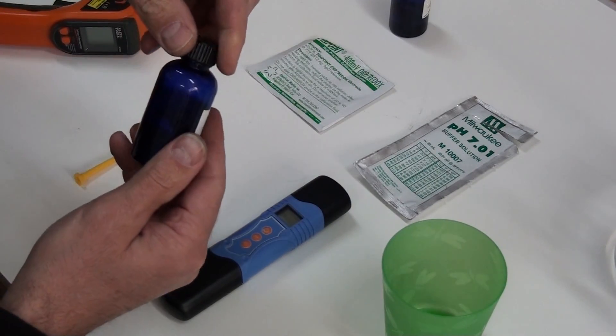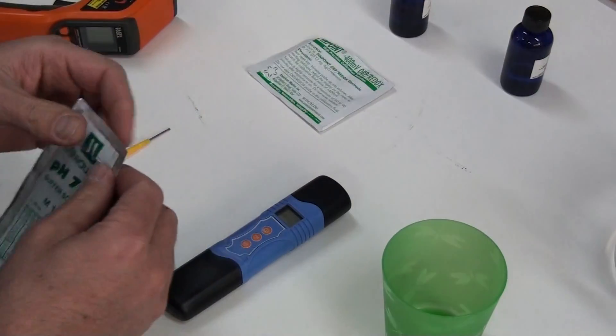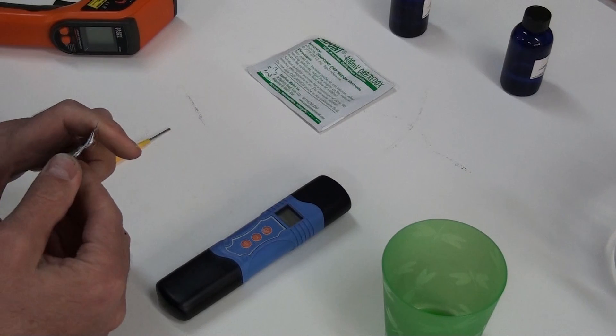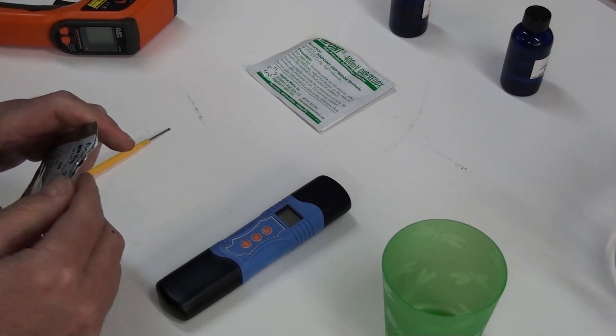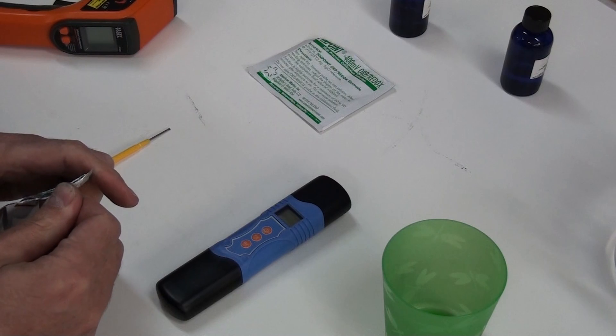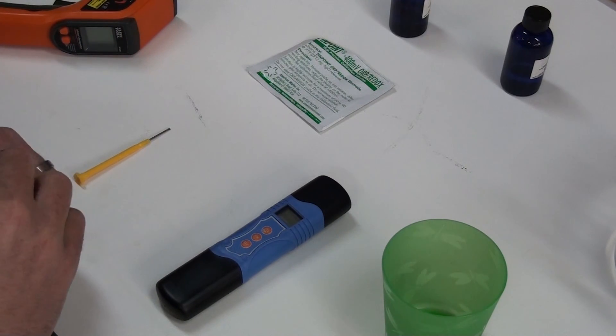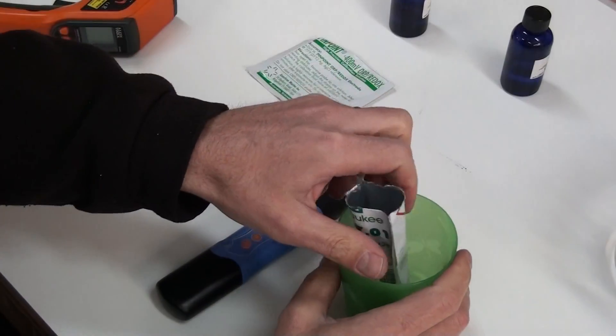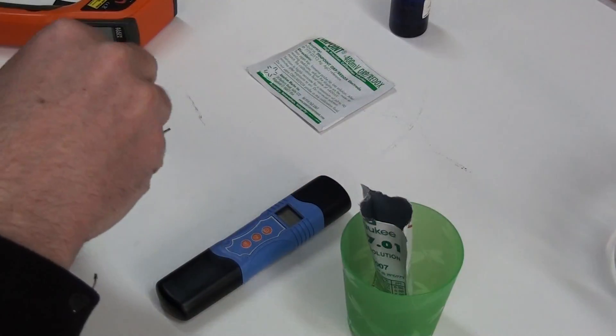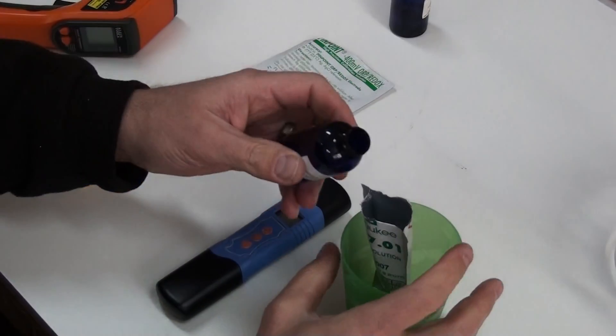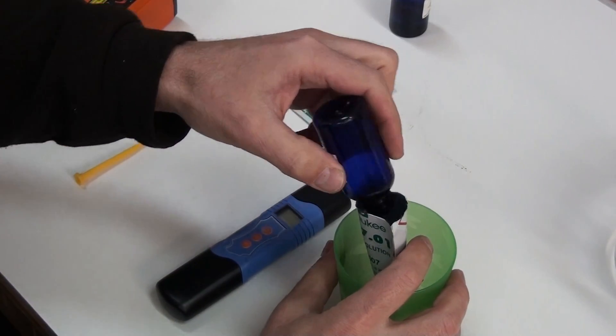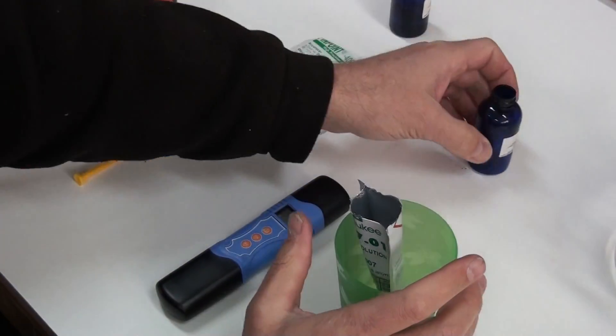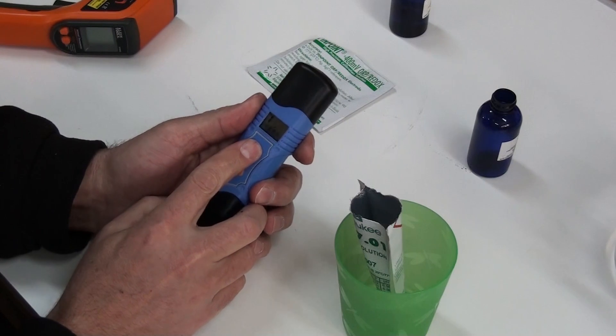What I want to do first is the pH solution and I'll go ahead and get that ready. I think the easiest way to do it is put it in this cup and we will pour the contents back into the package. Turn on our meter.